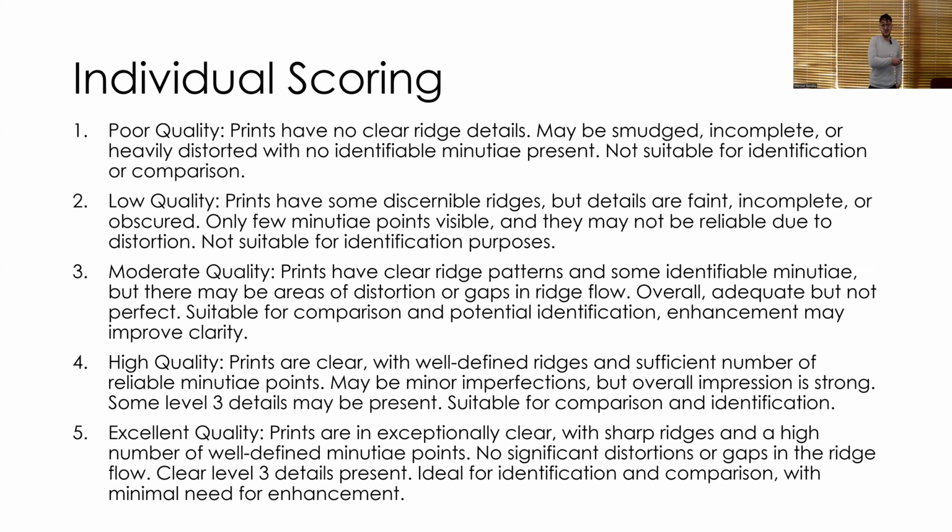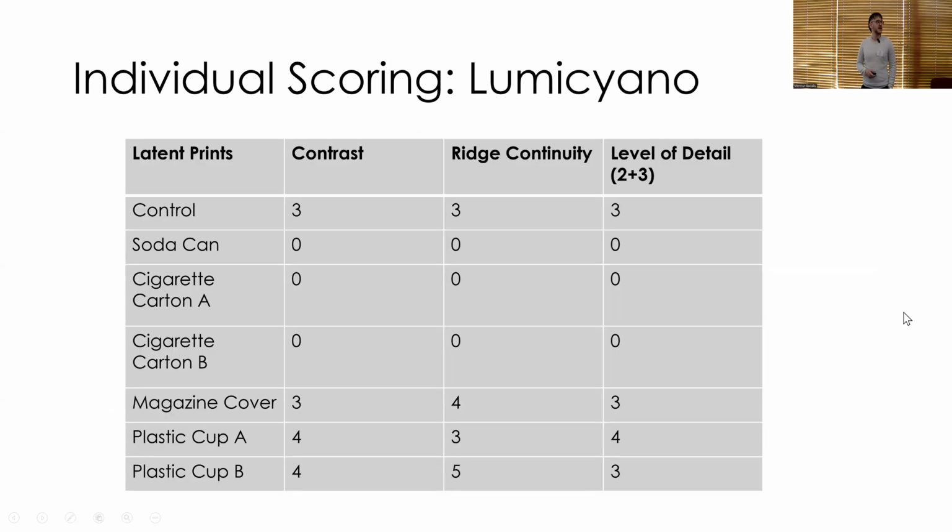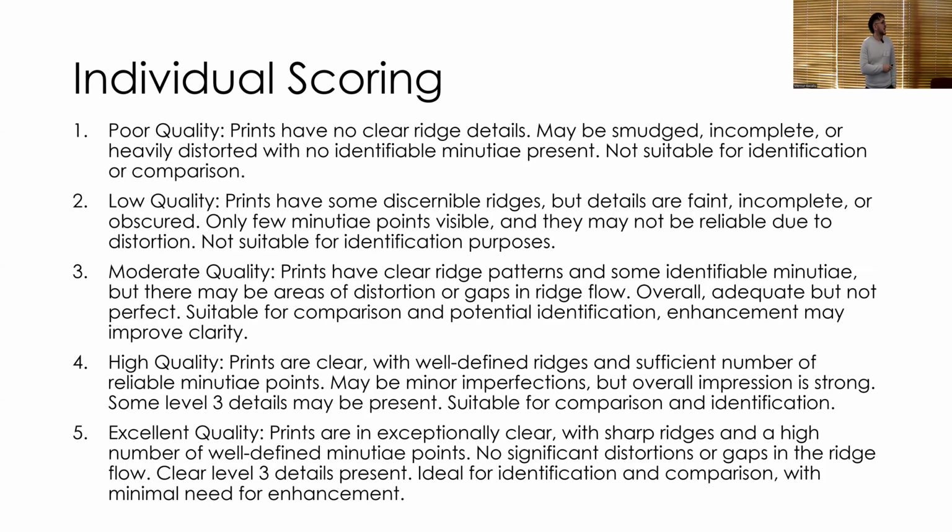So there's a lot of words, but I'll break it down really simply for you guys. Individual scoring, we have, if you get a 1 or a 2, that's a pretty low quality print. If you get a 1, you can't use that, right? That's where a lot of our non-suitable prints come from, a score of 1. There's no detail. It's heavily distorted. You cannot use it for identification or comparison or anything like that.